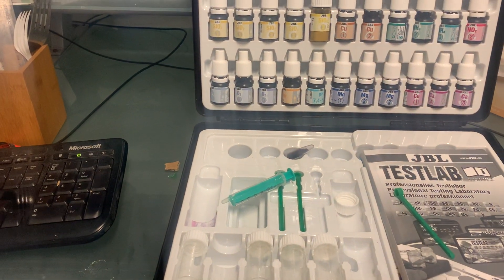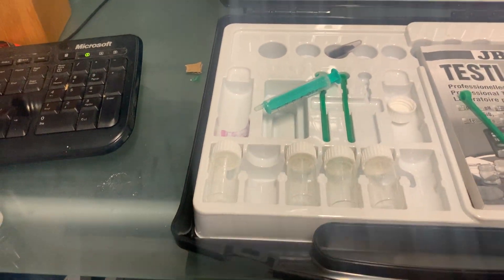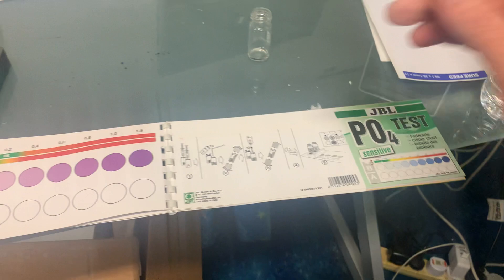The key to doing accurate tests is to make sure your test kits are not too old, make sure your test tubes are all nice and clean, and then just follow the instructions exactly. So let's do a little test.